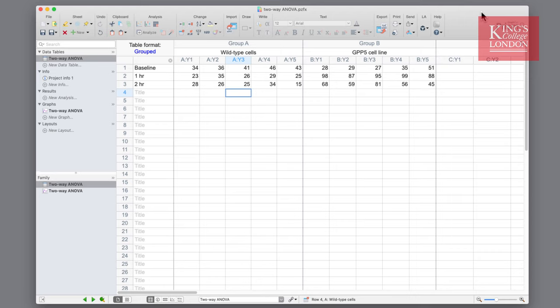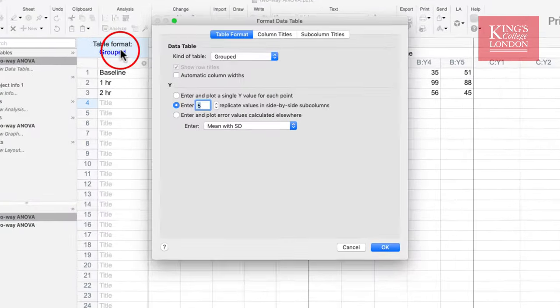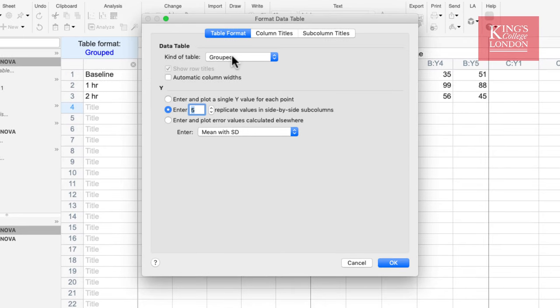In order to carry out a two-way ANOVA in Prism you need to make sure that your table is formatted as a grouped table. You can do this when you start a new file in Prism, but to show you the settings used in this file we can click on the table format button. In this case our table is grouped and we have chosen to enter five replicate values in side-by-side subcolumns because we carried out this experiment five times in five independent experiments, so our N is five.